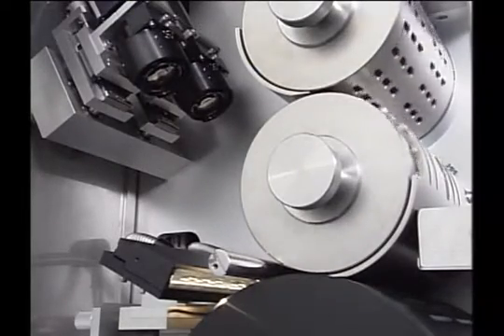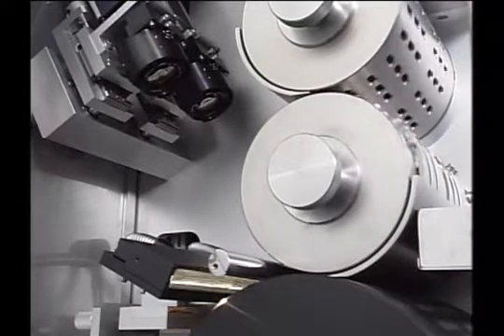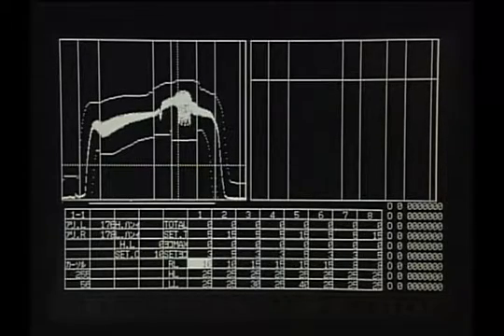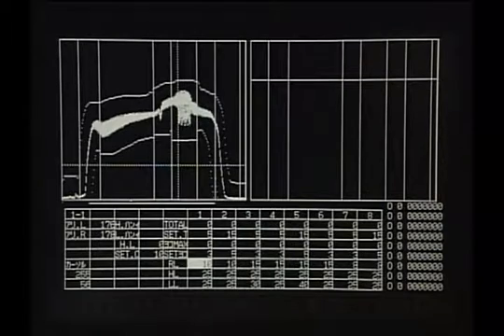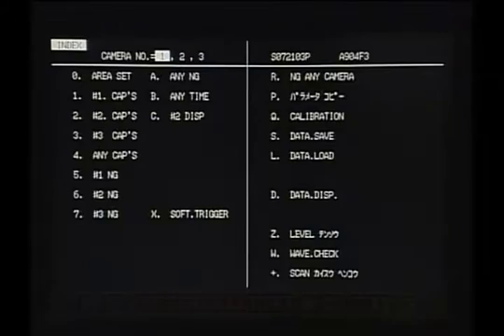In consideration of the combination of colors for the cap and body in the printed area, the capsules are divided into eight sections in the direction of the long axis. It is possible to inspect precisely and with high accuracy by setting the inspection parameters in each block.